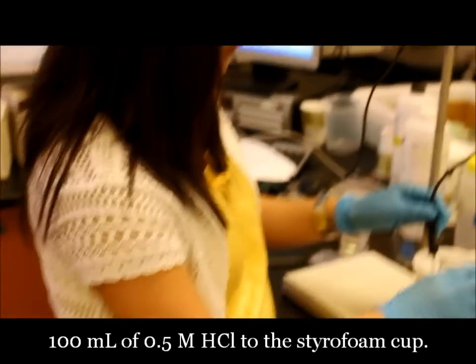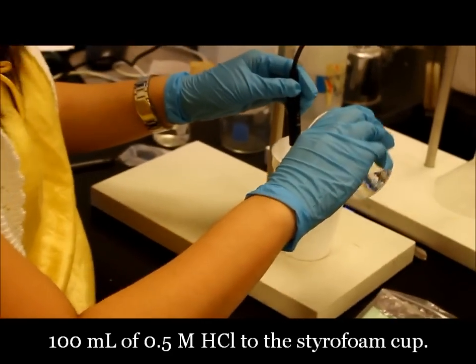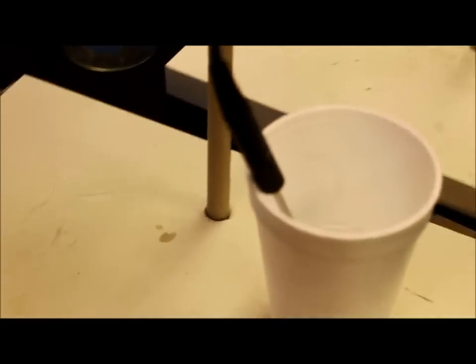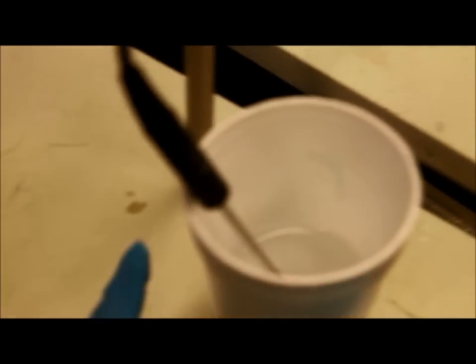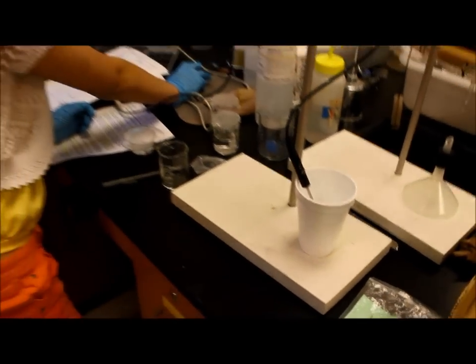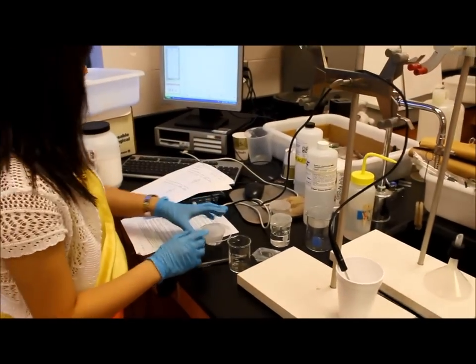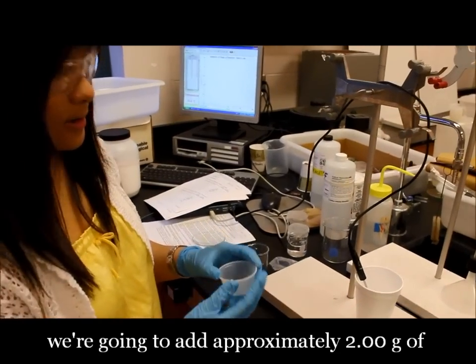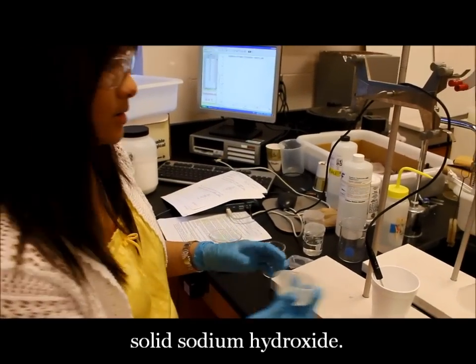So for the second reaction, we're going to add 100 milliliters of 0.5 molar hydrochloric acid into the styrofoam cup. Then we're going to collect the initial temperature, and we're going to add possibly 2 grams of solid sodium hydroxide.